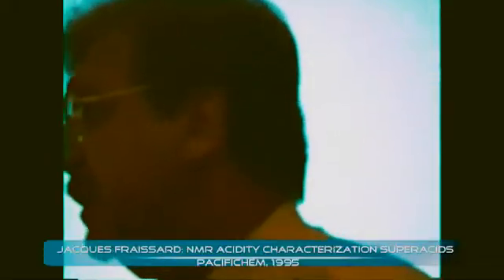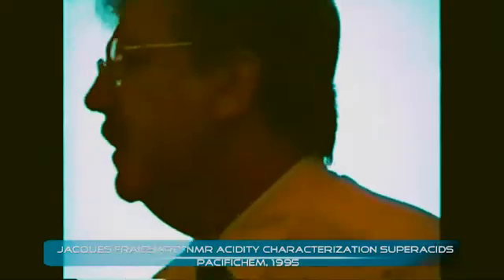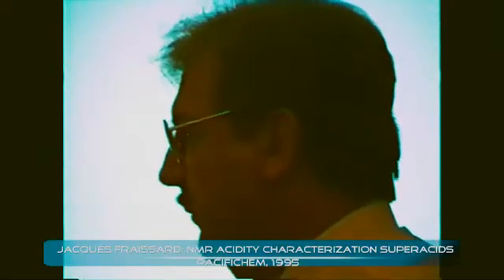As you know, it is a new technique, so we have to give you some information about the technique itself before giving some results concerning superacidic and non-superacidic solids. As you know, the problem of determining the acidity scale of a solid, in my opinion, has not yet been resolved. Of course, there are many techniques for determining the acidity strength of a solid, but the number of these techniques proves that none of them is really valid. There are two ways of studying the acidity strength of a solid. Either you look at a bare solid using some spectroscopy techniques, or you study the interaction between the solid and an adsorbed phase.